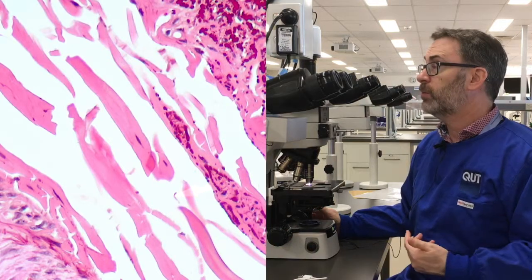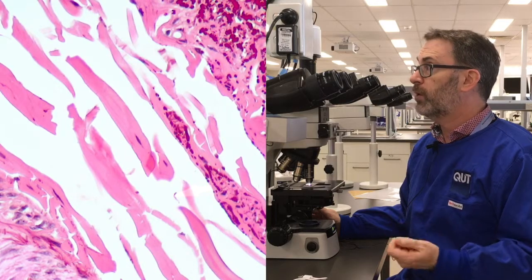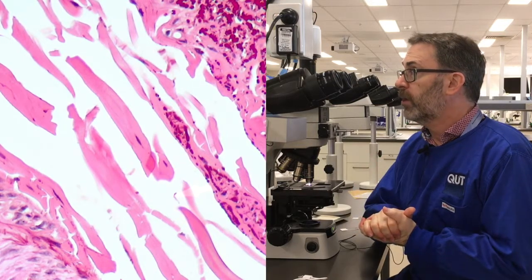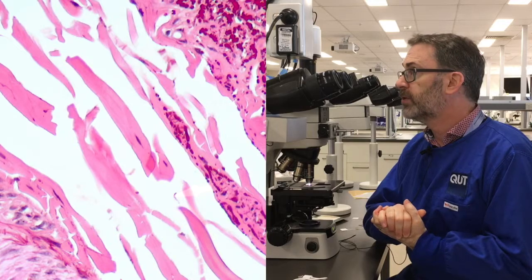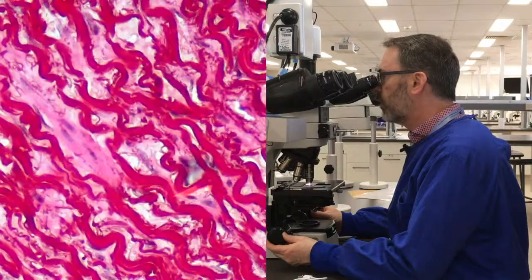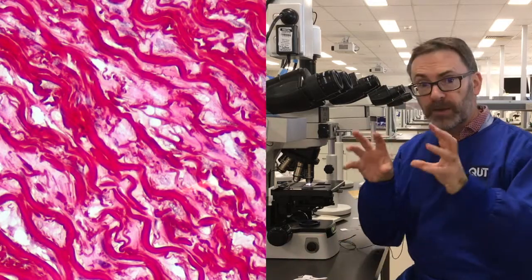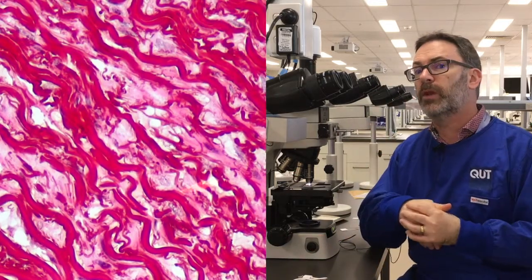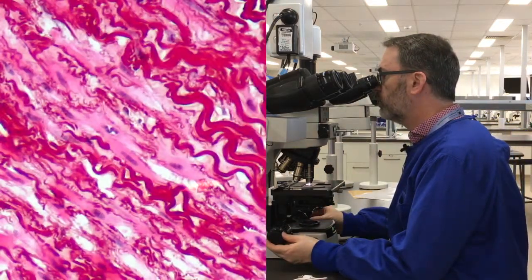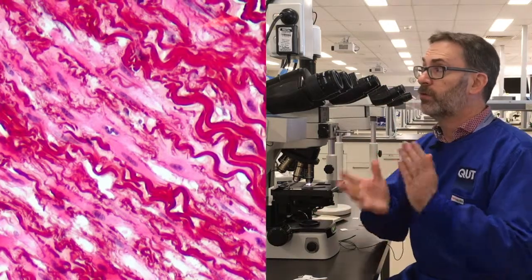The fact that we've used eosin here, which is a pink stain, it's still contrasting quite nicely with those brick red elastin fibers — it's a really great result. I really don't have anything I could criticize this one on. Going a little bit further in, these are the very thick elastin fibers within the internal structure of the aorta itself. What I often look for when navigating through that area as a check is to see whether the cell nuclei can be seen as well, and I think there's pretty reasonable staining of the nuclei within that space. So overall, this is really good.